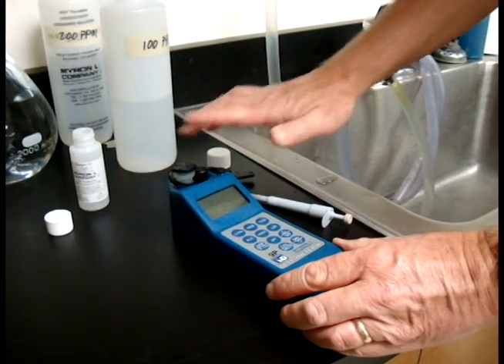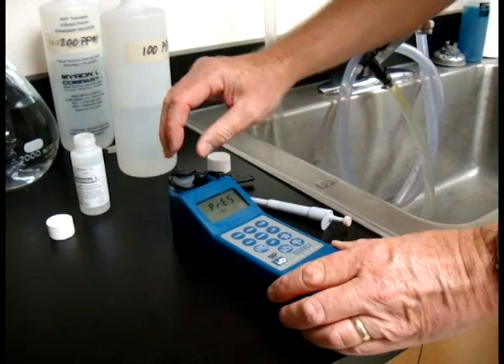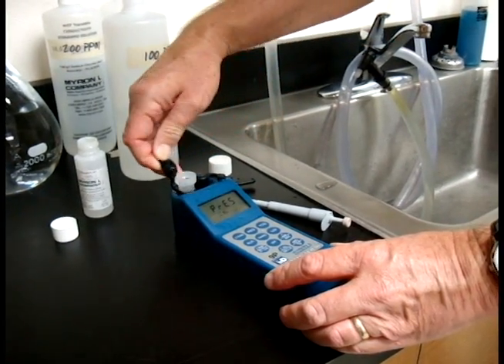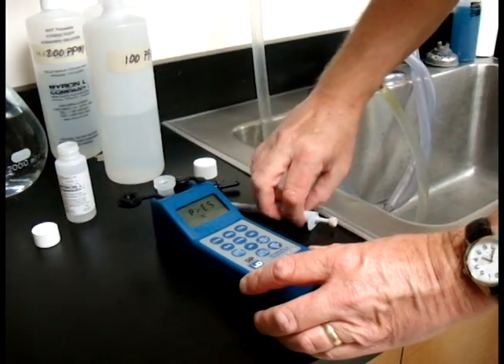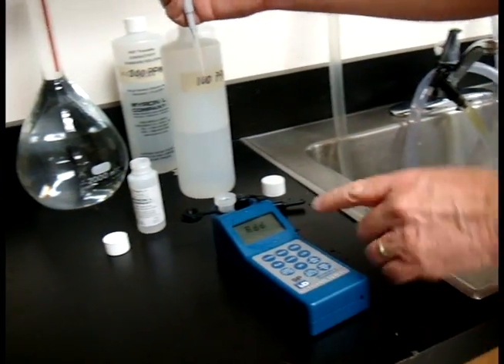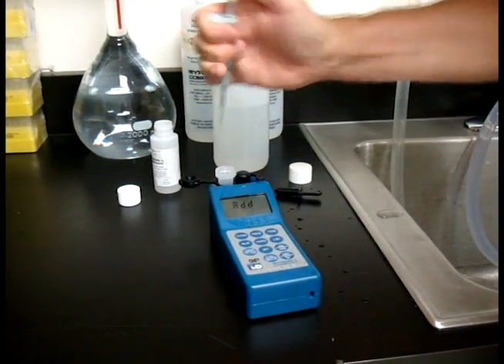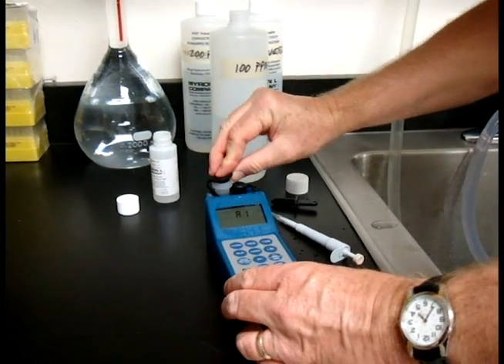Now it says press CAL. It's already got its number, so come over here and make sure you get your cap off first before you hit CAL. Pull this off slowly. Make sure that there isn't a solution attached to the cap. Hit your CAL button, and it's going to ask you for A1, reagent A1. Let's put that into our cell cup. Put the cap back on.